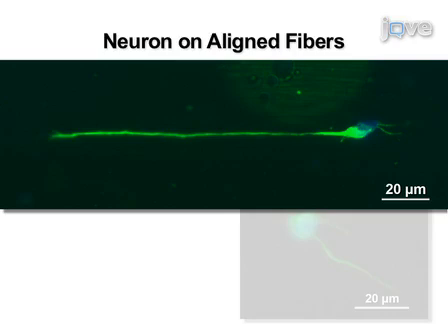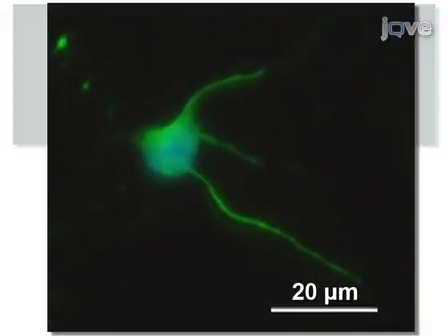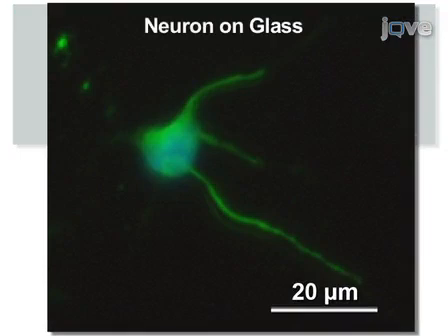The major processes of cells cultured on fibers are much longer than the major processes of cells cultured on glass at equivalent time points. On glass, motor neurons typically possess more processes at 24 hours, which extend radially from the cell body, than neurons cultured on fibers. The major process is also shorter on glass than those seen on fibers.